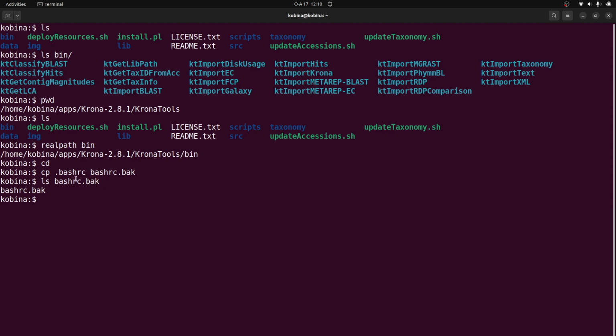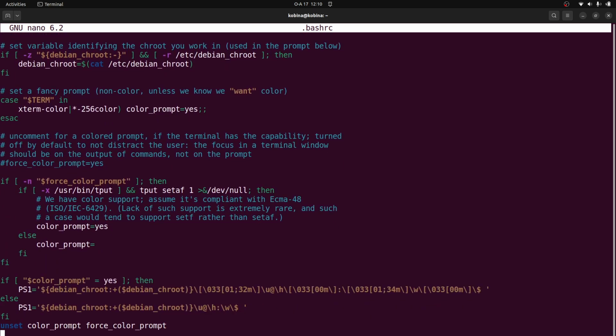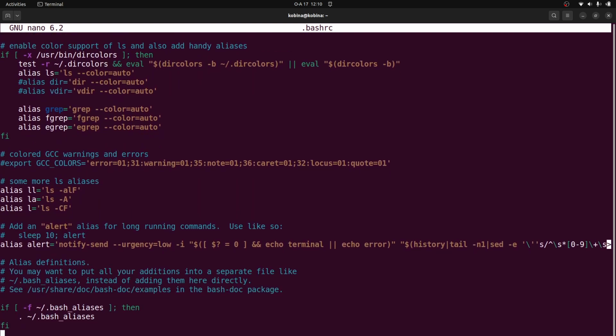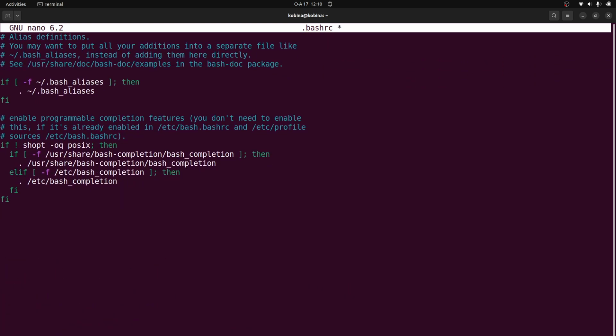So what we will do is to open the .bashrc file. I'll use nano, that's what I use, but I can also use vim or any text editor, that's fine. So we'll say nano .bashrc, and then I will scroll down to an empty space. You should go down to the bottom. Okay, you can see, if it's a new installation, probably all these places are blank. So I'll just do it here.